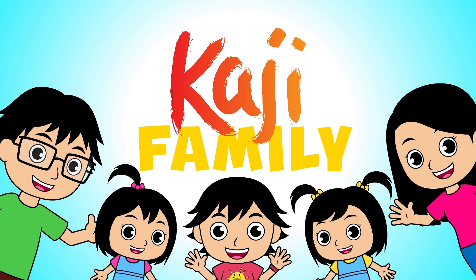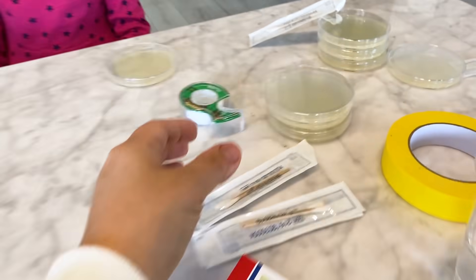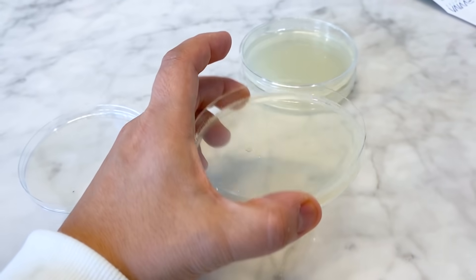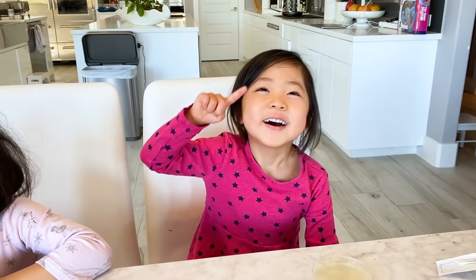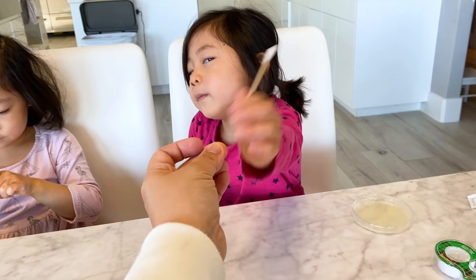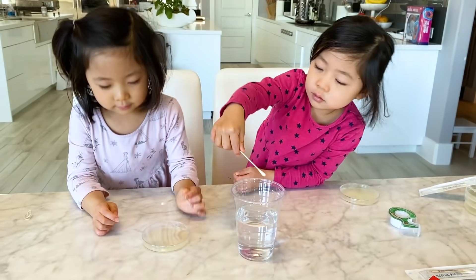Paji family! Hi Emma Kay. Hi Mommy. What are we doing today? A science experiment. These are called Petri dishes. So inside the Petri dish is agar, and inside the agar there's actually food for bacteria. So Emma and Kate are going to go around the house and look for bacteria. We're going to see if my phone and my laptop is clean. So here's a cotton swab for you, and one for you. Dip it in water — get it a little bit moisturized because bacteria likes moisture to grow. Now find a place you want to swab.